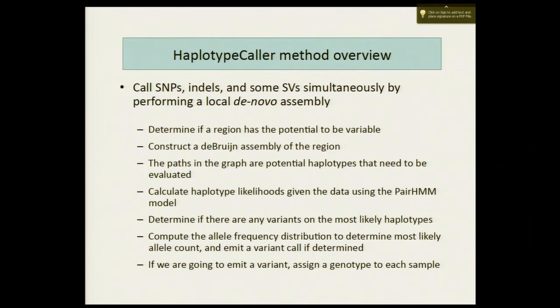So you can modify that by a command line argument based on your data and based on what you think should be different priors for populations, or if you're doing somatic analysis or whatever. Or a different organism.